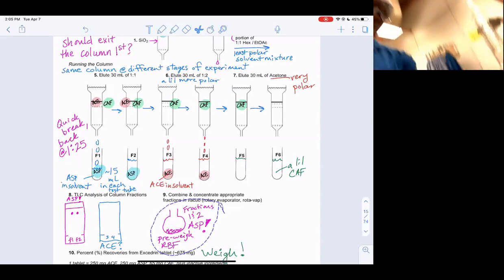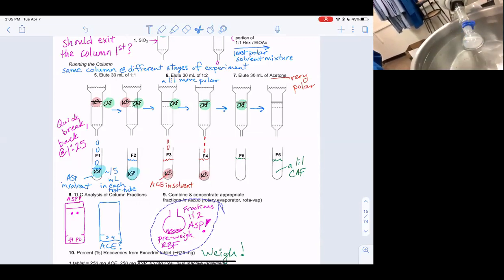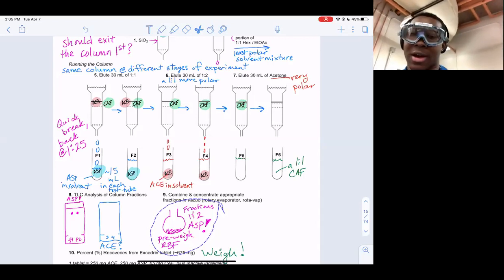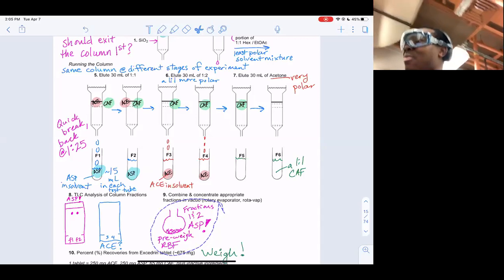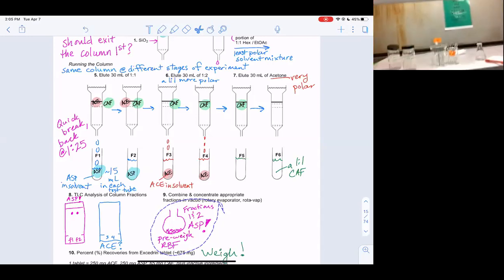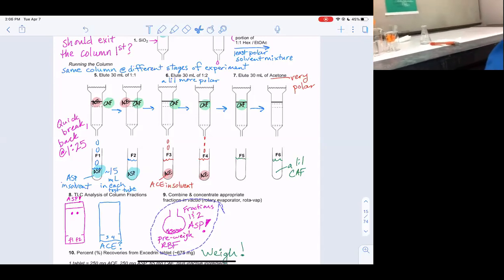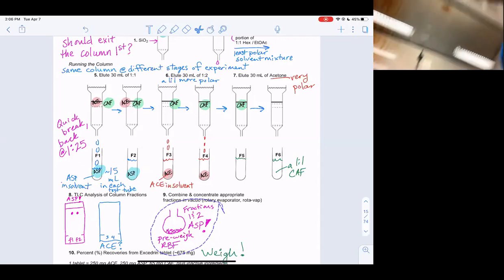And so we have the aspirin that's being dried down. It is a white solid, which is really nice. Not all things that you purify will be solids. Some might be oils, so just keep that in mind. But this one's a pretty white solid. And over here, we have fractions three and four. We have a TLC plate right here. There you go. And we're going to TLC that.